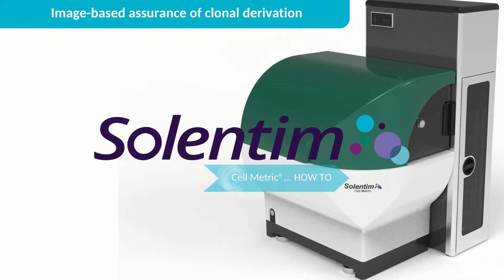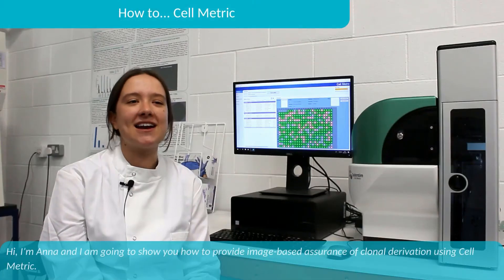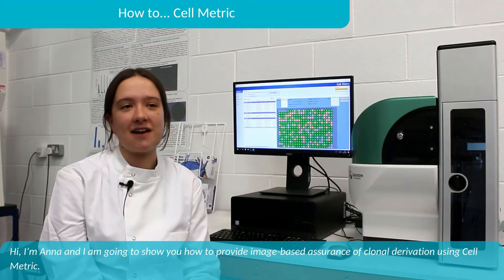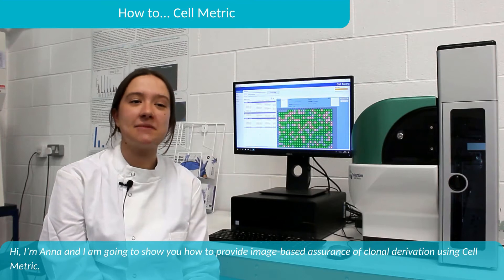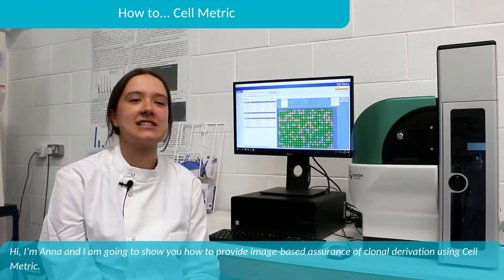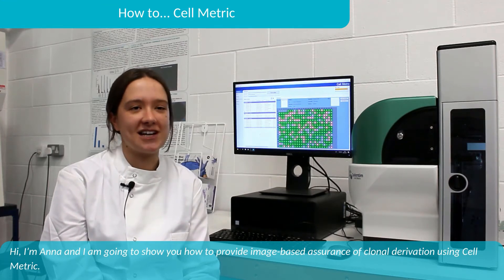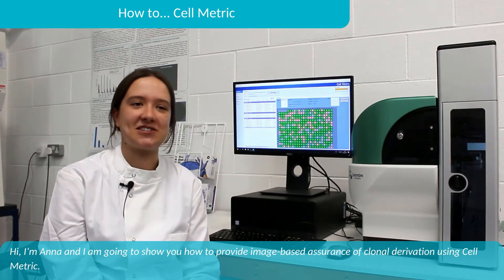Welcome to the Cellmetric how-to series. In this video you will learn how to use Cellmetric. Hi, I'm Anna and I'm going to show you how to provide image-based assurance of clonal derivation using Cellmetric.